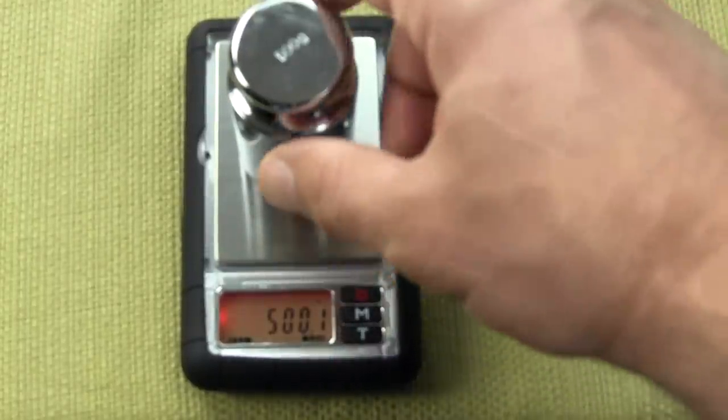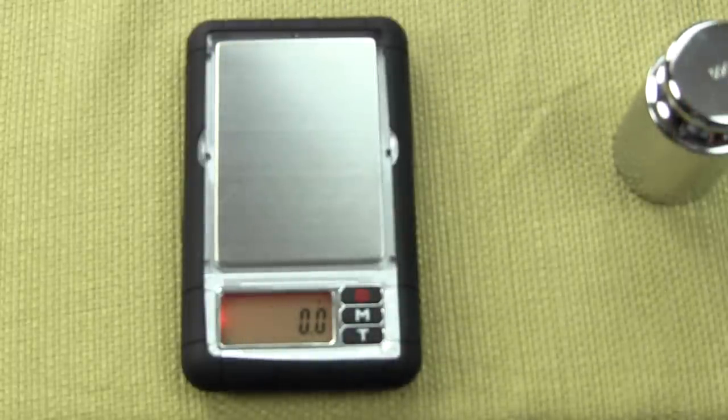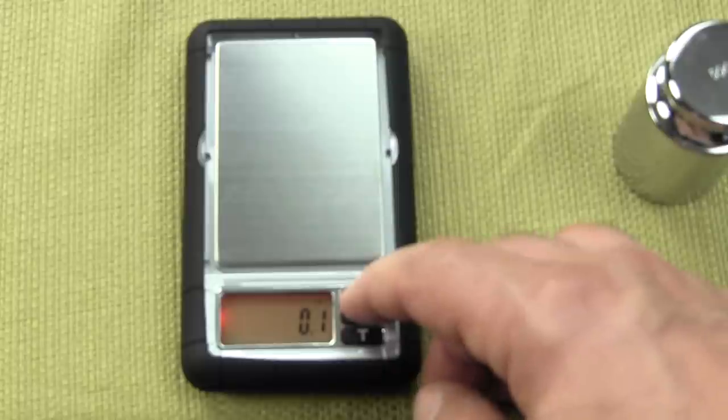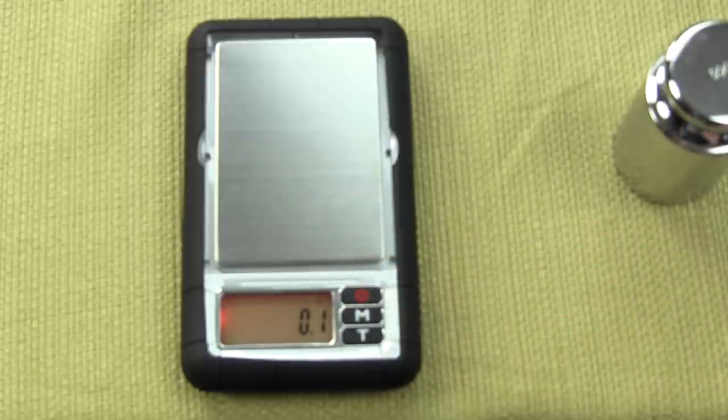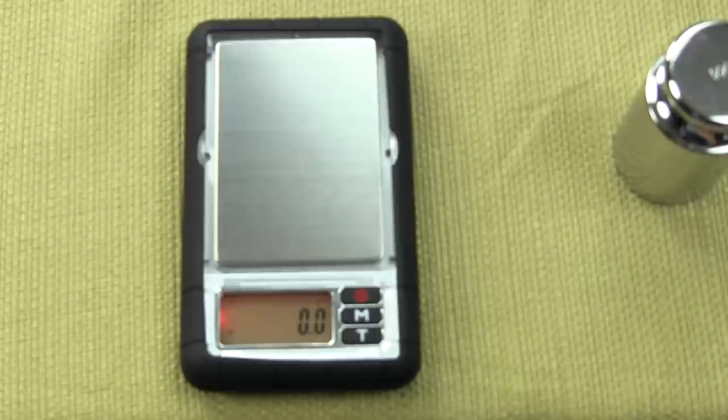We're going to show you in this video how to calibrate a Dura scale 600 gram scale. Calibration is simple. One wants to have the scale on a steady surface. Simply press the tear button to zero out.